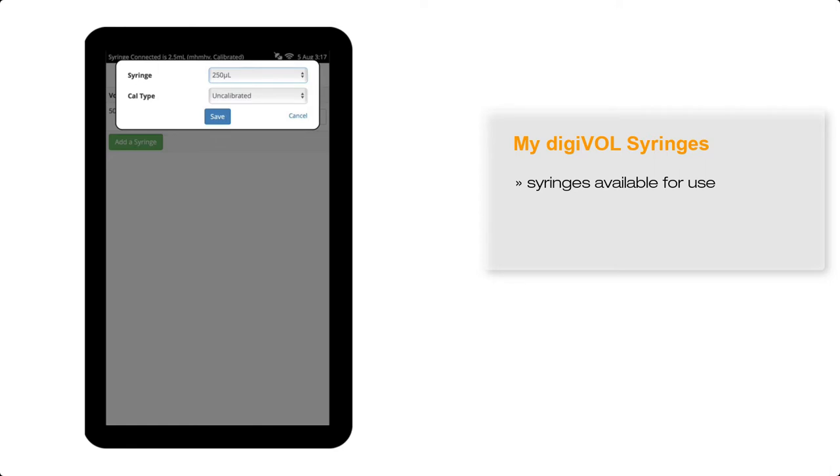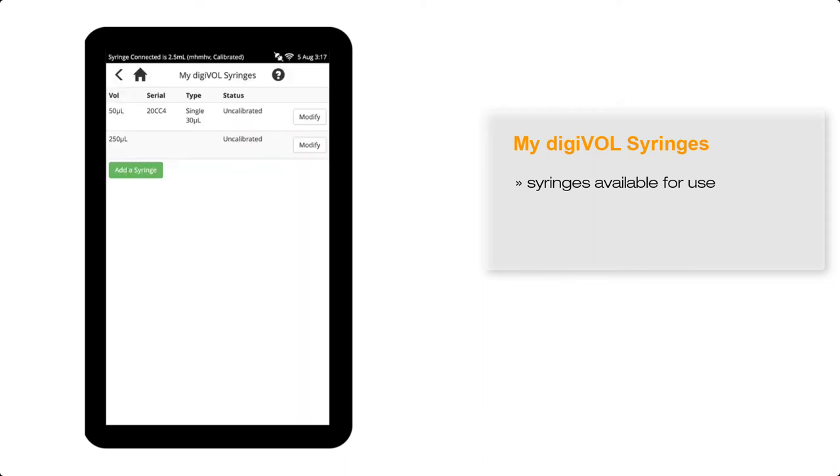To start with, I'll leave this as an uncalibrated syringe, which is the default, and then save this. You can now see the 250 microlitre syringe has been added to the list of available syringes for My Digivol.